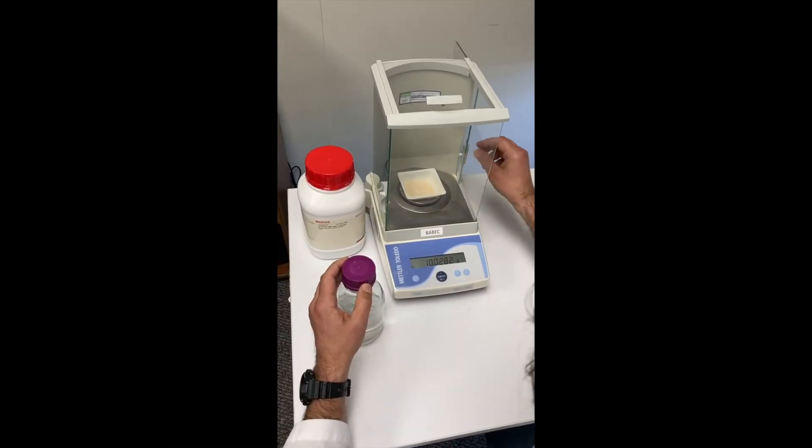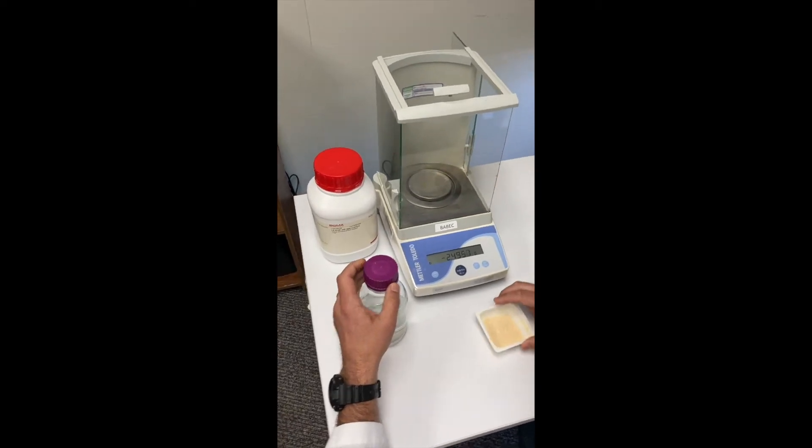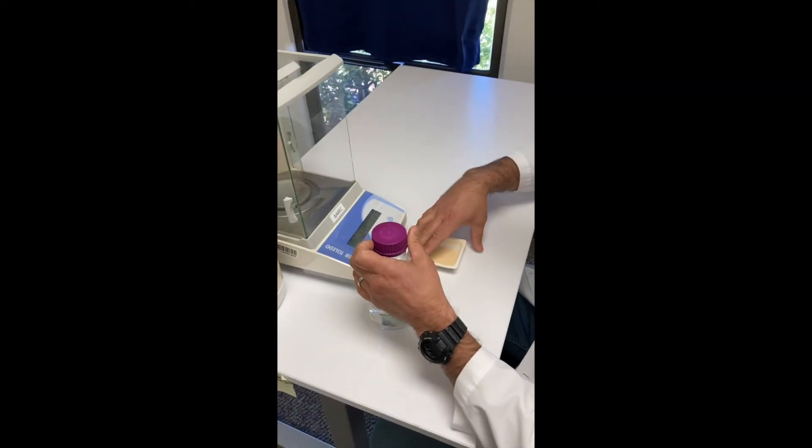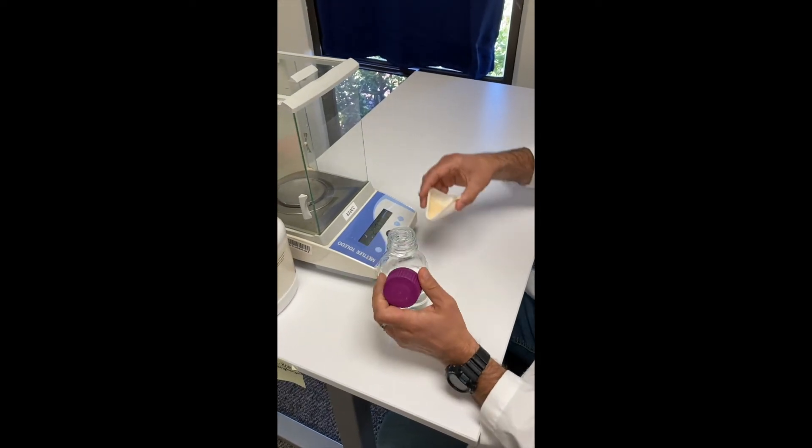To make LB agar with the antibiotic ampicillin, we begin with the same steps we did to make LB agar, adding the LB agar powder to water.